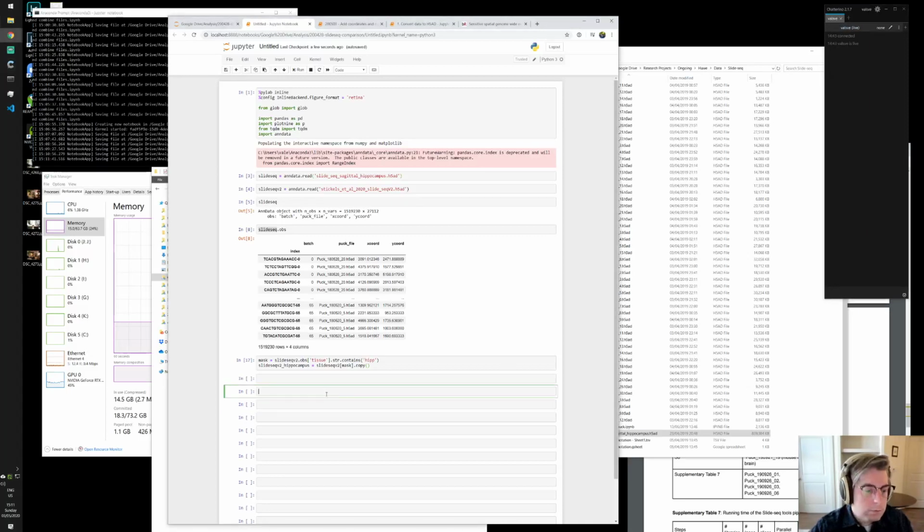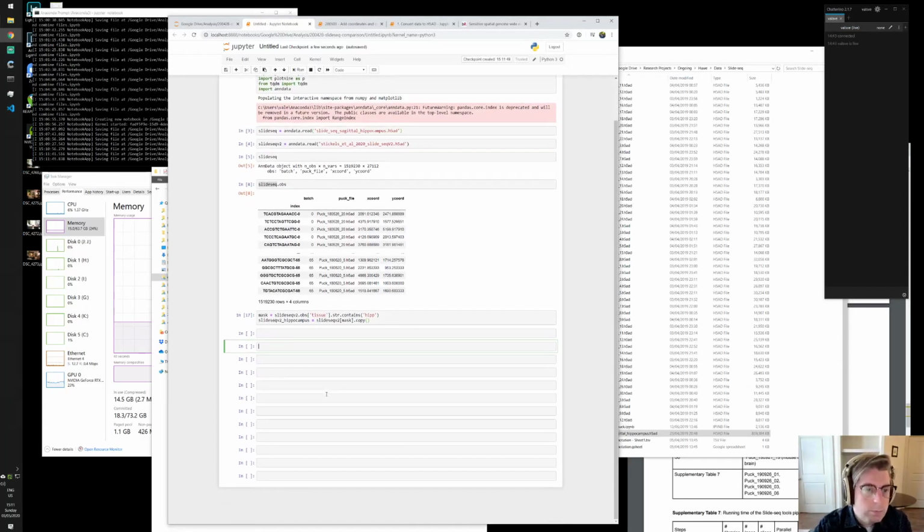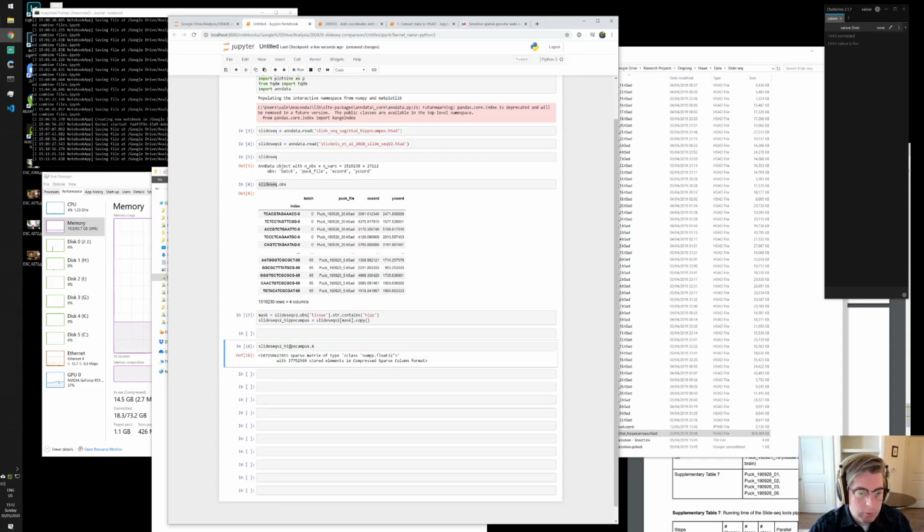And what do I want to calculate? So let's do this for the Slide-seq version 2 data first, because it's going to be quicker because it's smaller. So in this we have the X, which is the gene expression matrix, a sparse matrix. The first quantity I want to calculate is the total number of UMIs measured per bead. And we can get that by doing sum.